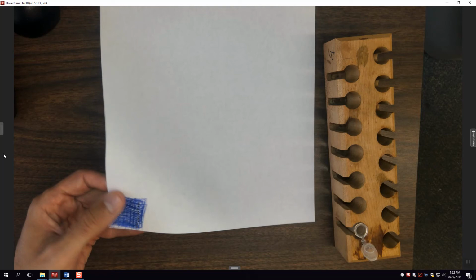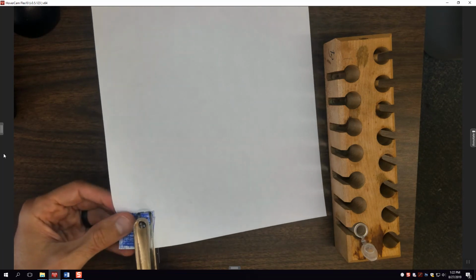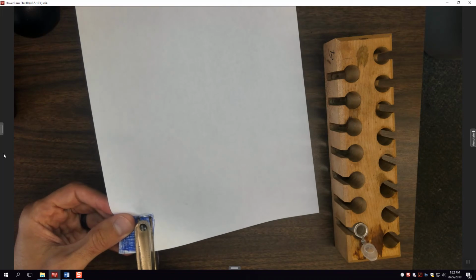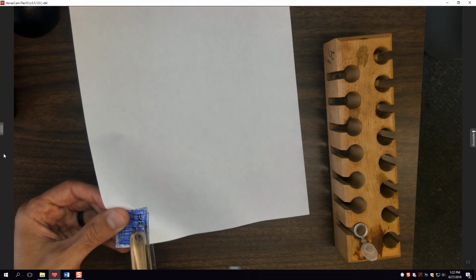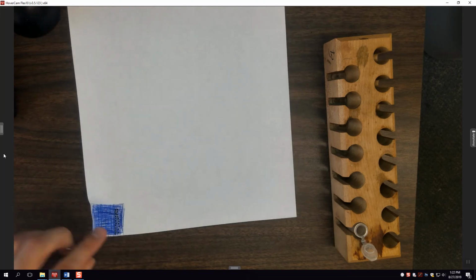All right, so I made a layer of holes like that. Now I can go just next to that and make another line of punched holes. And I want to get somewhere around 20 to 30 of these punched holes. And for the standards, 20 or 30 punched holes should be plenty because there's tons of ink on here.